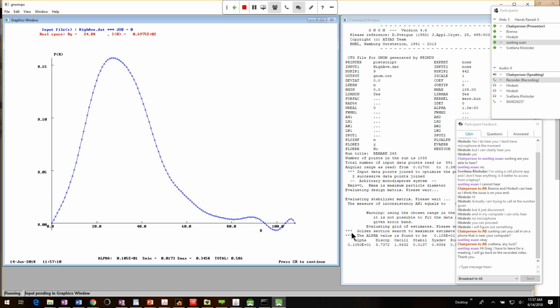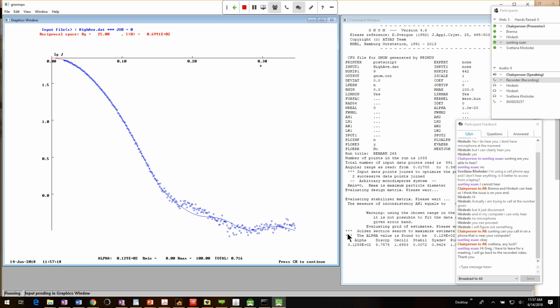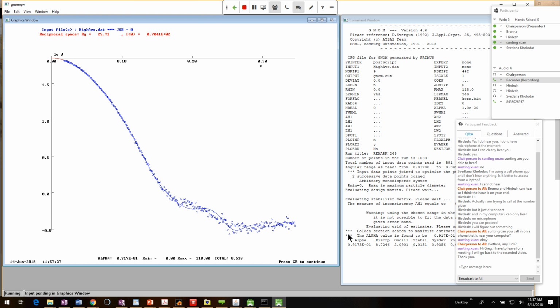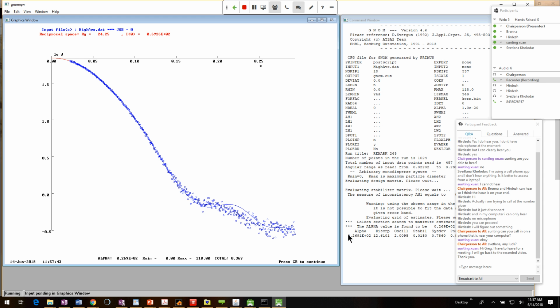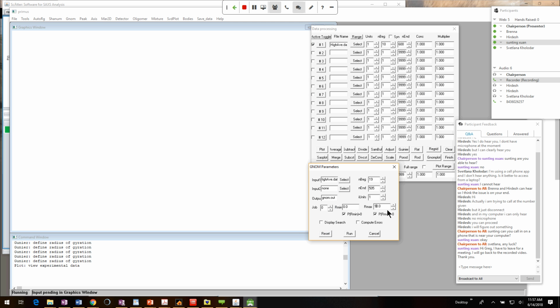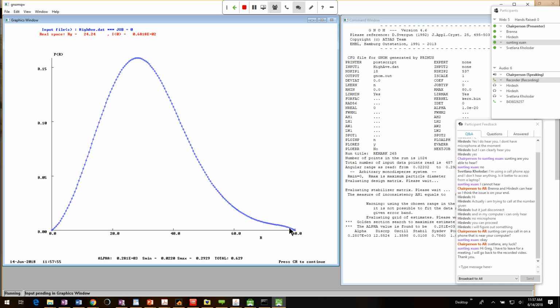Still not quite liking to fit the data. It's having a hard time. I actually haven't run GNOM on this thing, so I really want it to fit this data. So let's try 118. Yeah, GNOM's having a hard time. So it might be that I need to clip some data somewhere. Flip some of these guys back. Still not able to fit. Try the other way. All right, so at least it's smoothly feeding into the data set, into the small Q.